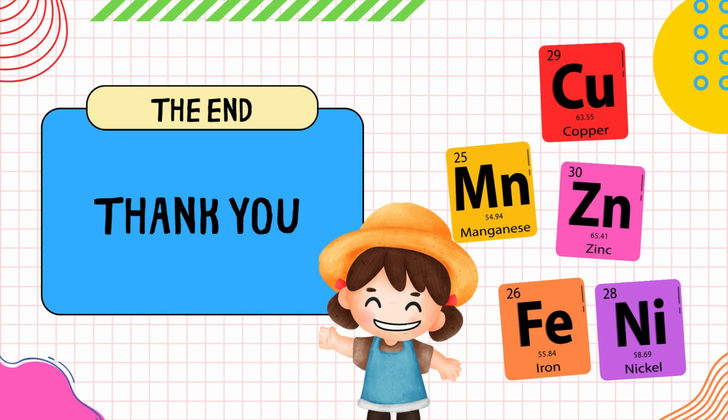That's it from us about potentiometry. Here we can conclude that potentiometry is an important method for accurately measuring electrode potential and ion concentration in solutions.